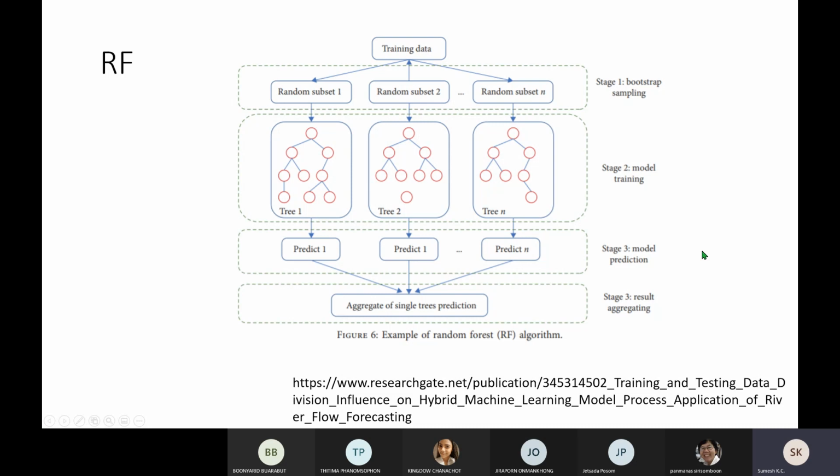When we input an unknown sample or unknown spectra, it starts in every tree: tree number one, tree number two, tree number three, and it gets the aggregate for the unknown data set. Tree number one says unripe, another says unripe, this says ripe. So now the aggregate will be unripe. You understand my point? This shows how the training data set develops the forest.